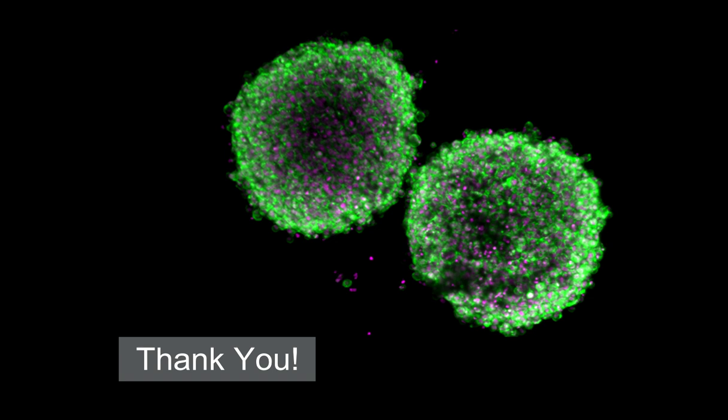So we've really found in our lab that using these treated Nunclon Sphera plates, we essentially just aliquot our cells into every well and incubate overnight, and we have nice round spheroids that are consistent and regular balls of cells for our models. So I definitely recommend looking into those.